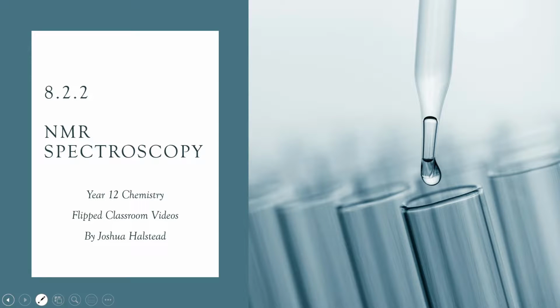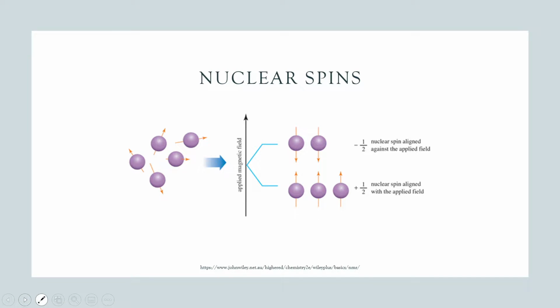G'day chemistry students, in this video we are again looking at dot point 8.2.2. Our focus is on NMR spectroscopy and how this spectroscopy technique actually works. Let's get into it. Now the first concept that I'm going to introduce is this idea of nuclear spins.